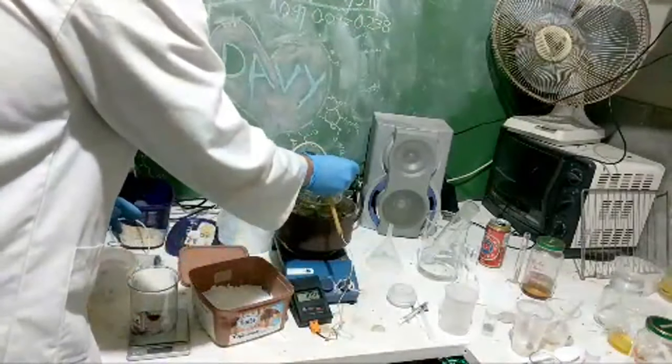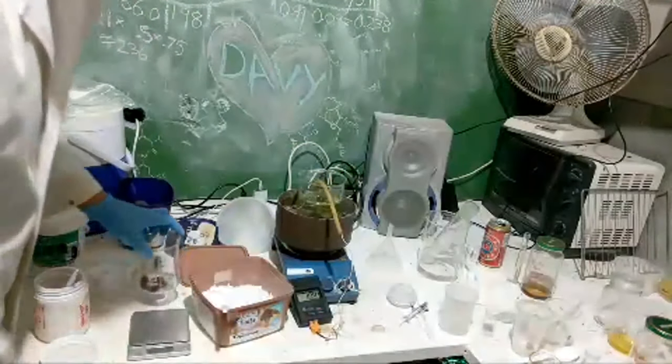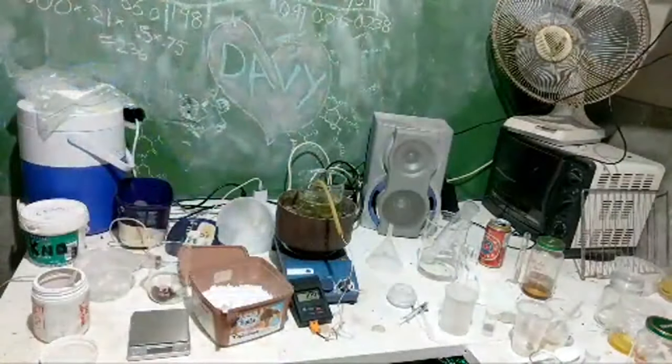I just wanna start putting it in. Hopefully the temperature doesn't spike too much, because we'll kill all the bleach if the temperature spikes.